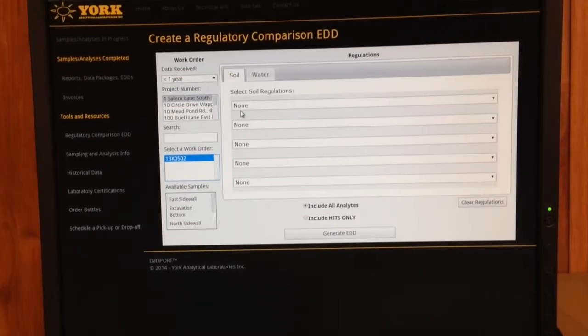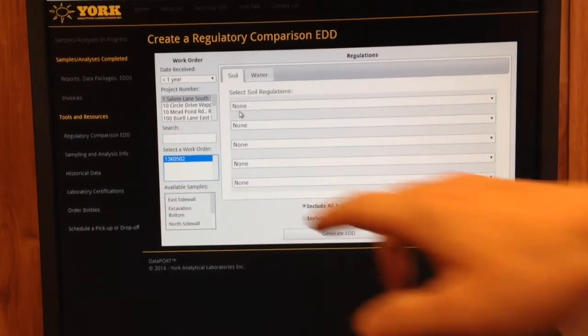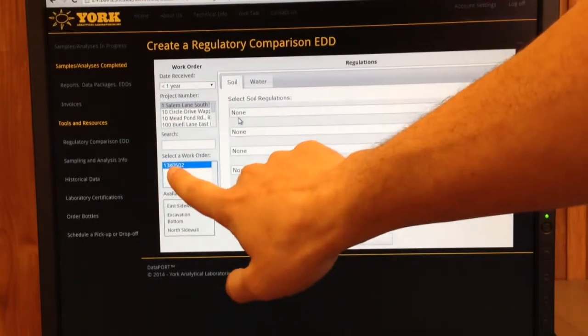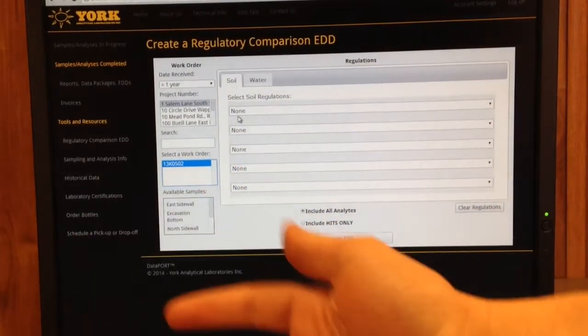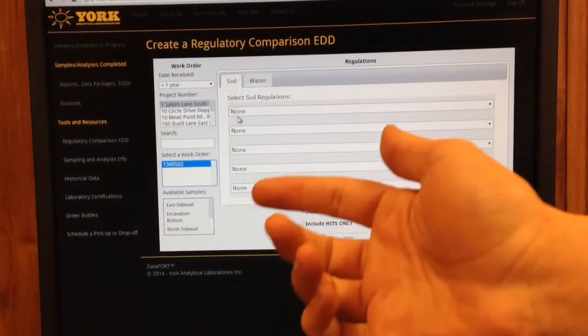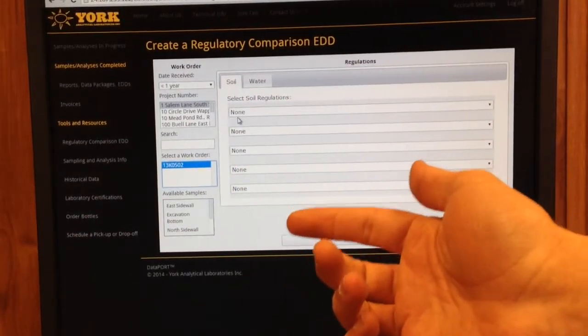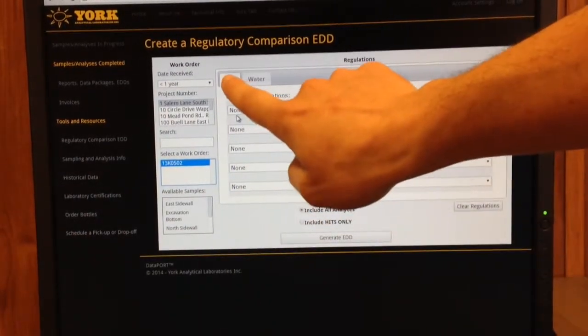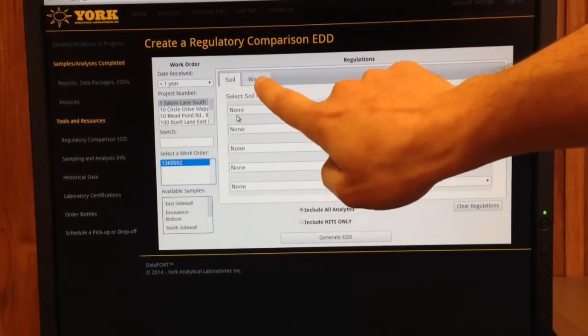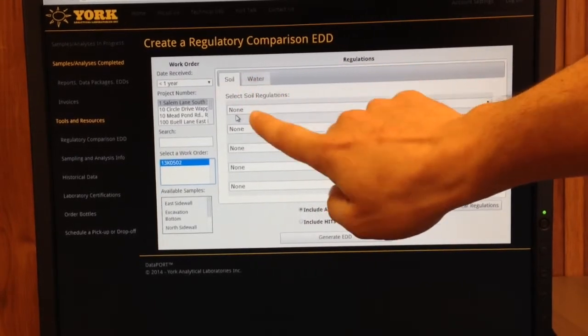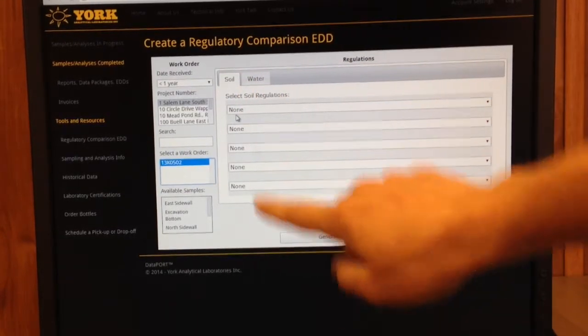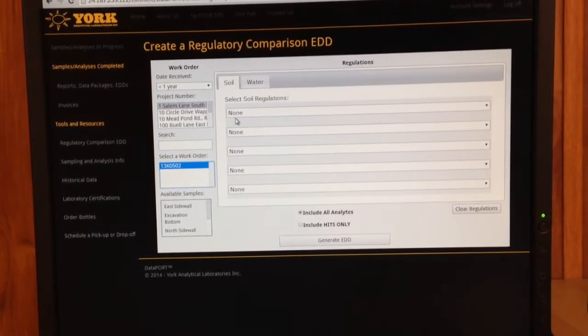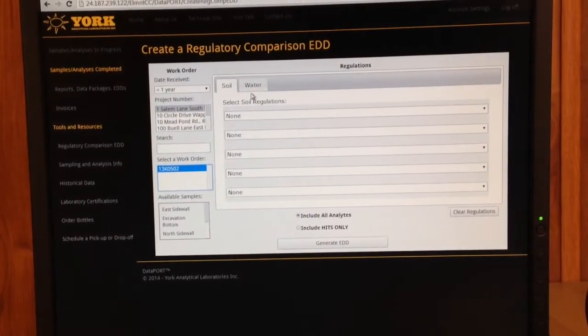You've got the option to pick what project you worked on and what work order we assigned it. It's important to keep in mind that when you choose a work order, there might be soil, water, or air involved with it. You can see at the top there are tabs for soil, water, or even air, and then you can choose the Regs below.